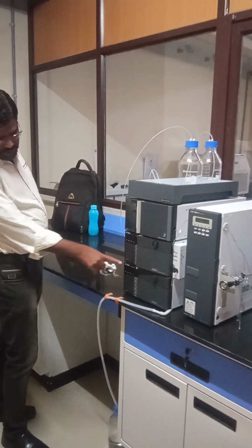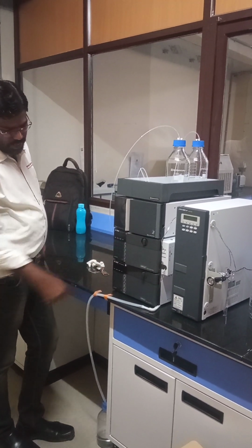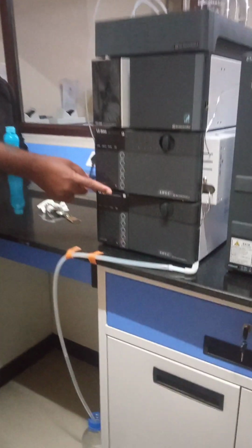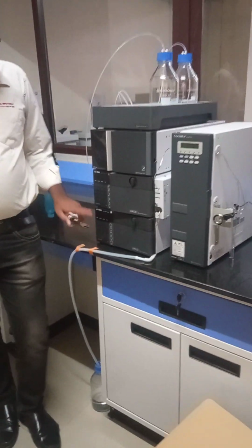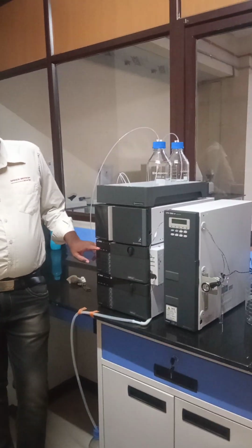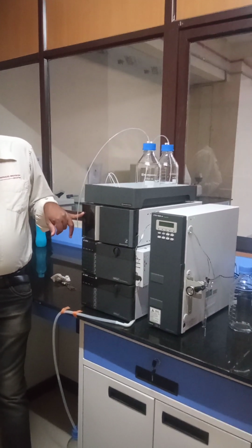Next is the LC-20AD pump A, already labeled. Next, the LC-20AD pump B. And the detector, SPD-M40 PDA detector.